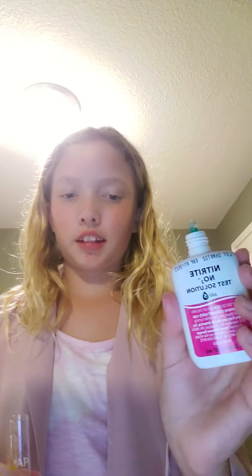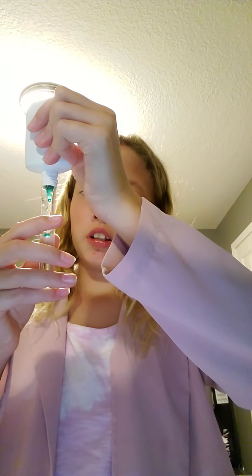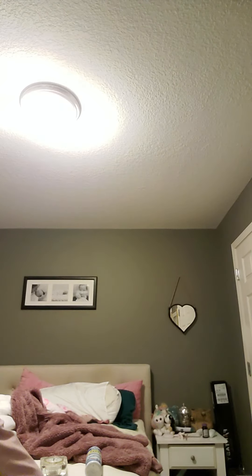Nitrite is right here — I think it's supposed to be pink, I don't remember. Oh, it's blue but the chart's pink, and it's blue, so — five drops: 1, 2, 3, 4, 5. Nitrite, please be good... heck yeah, baby!